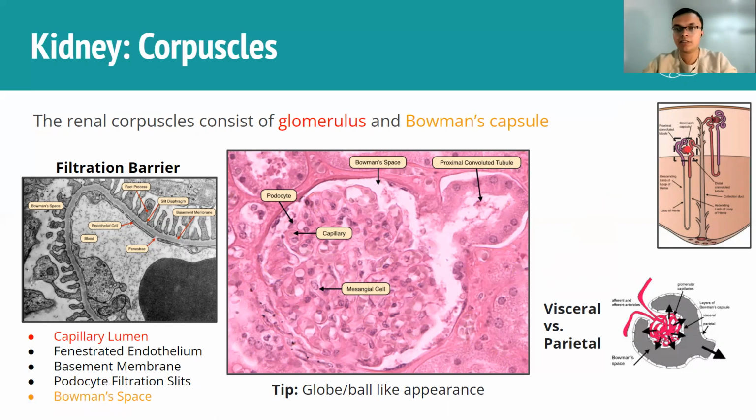You can see this glomerulus right there, and you can see there's an afferent arteriole entering and an efferent arteriole leaving. And you can also see that if you follow the nephron back around, up, down the loop of Henle, the distal convoluted tubule actually comes back and touches the vascular pole, the site where those arterioles are entering and exiting. You can't really appreciate that as well on this slide, but it does exist at the vascular pole.